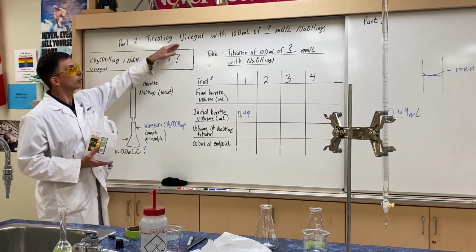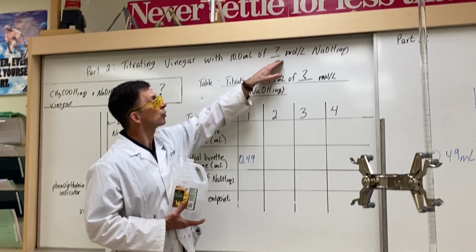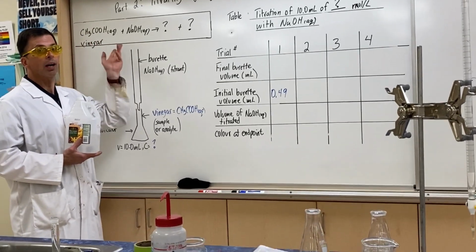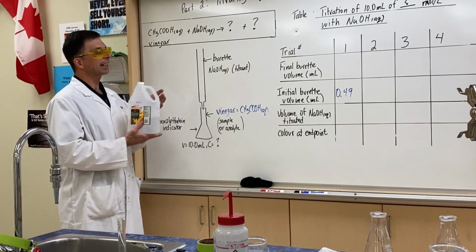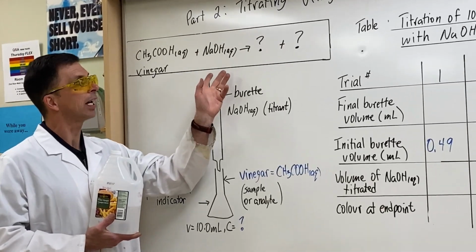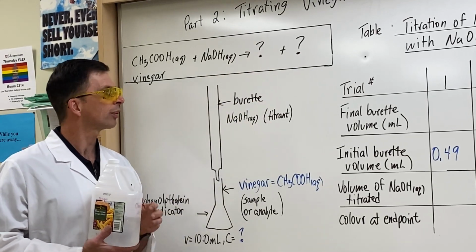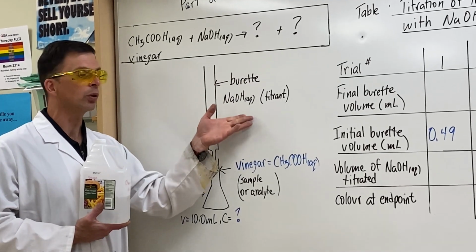We're titrating vinegar with 10 milliliters of a specific amount concentration of sodium hydroxide, which you need to calculate from part 1 of the video. Here is part of the balanced equation. Acetic acid is the active ingredient in vinegar. It's going to be reacted, titrated with sodium hydroxide in an acid-base neutralization, a double replacement reaction producing 2 products. Can you predict what products will be formed there? Once again, our titrant in the burette is sodium hydroxide.